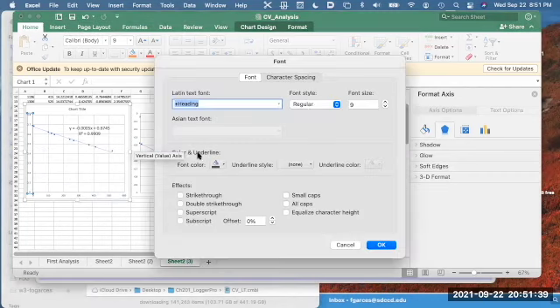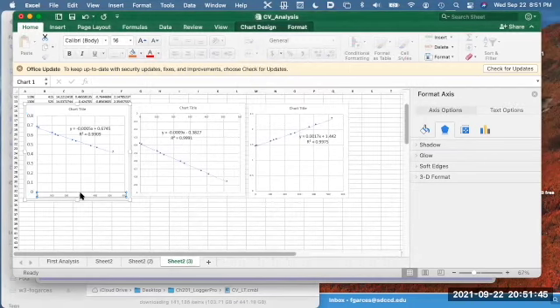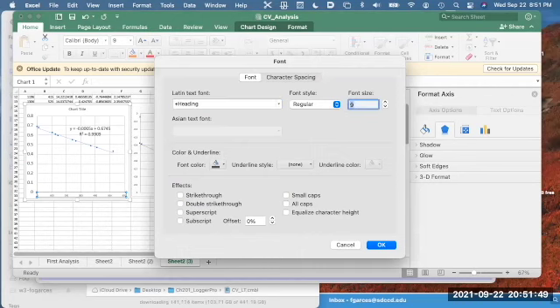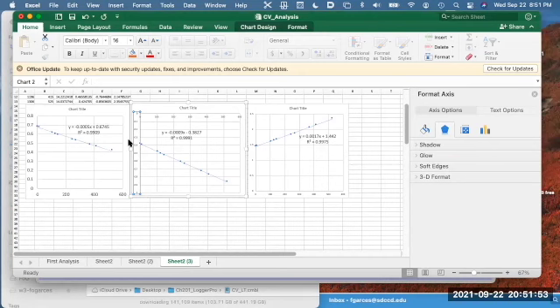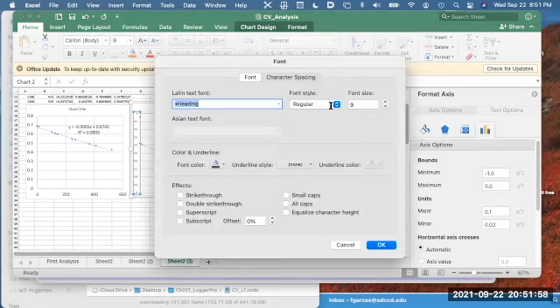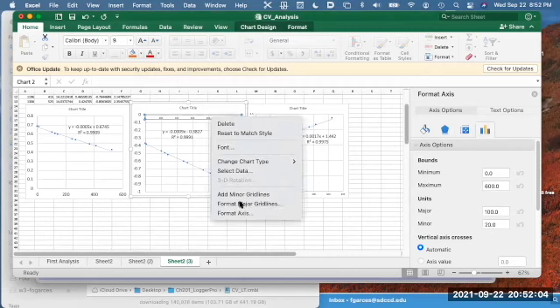And if you compare that to one in which we use the full data set, you'll see again you come to the same conclusion as to which one is the best fit. And depending on whether it's absorbance versus time, natural log absorbance versus time, 1 over absorbance versus time, you now know the order is 0, first, or second with respect to crystal violet.